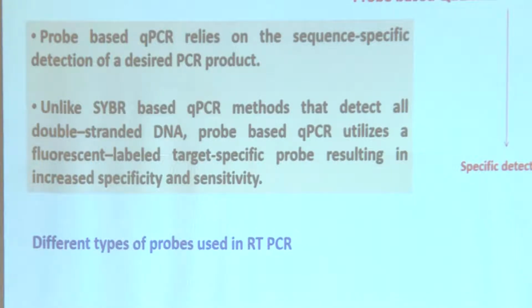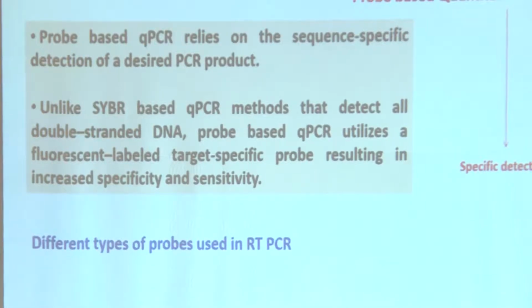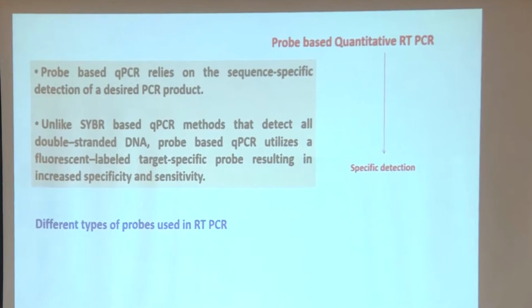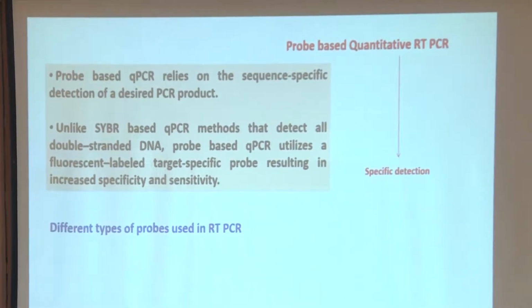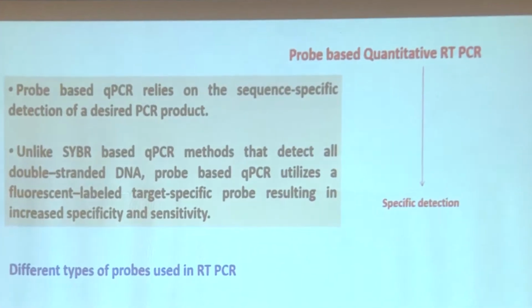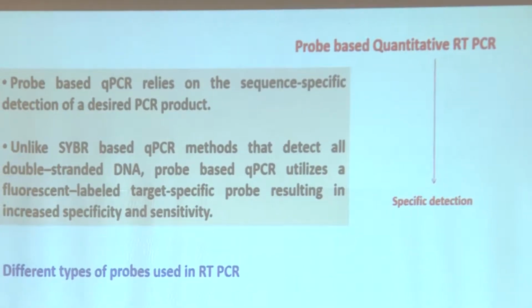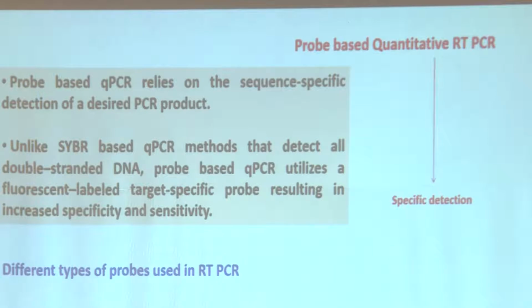How many of you have done this? I am sure none, correct? The dye based one is very popular, everybody uses it. They claim that my primer is the best one in the world, so I do not need probe based real time PCR.